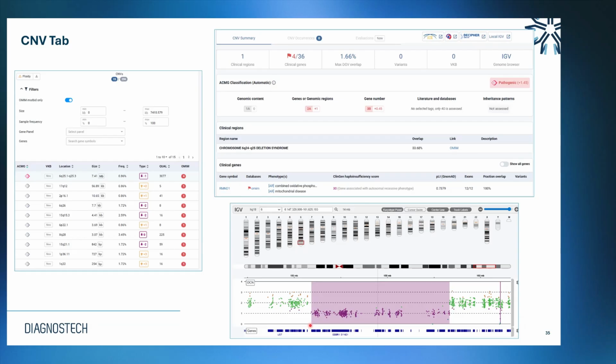It is, as I said, quite a large region of about 7 megabases. And what we are looking at here is the diploid copy number. So obviously being humans, we have 2 chromosomes, so we should have 2 copies of each gene. And that's indicated by these green dots. And these are the probes that were actually used, and we can see the genes at the bottom. So this is normal, being 2 copies. And then we see this drop off here for this section, where we only are seeing 1 copy of the gene throughout all these different genes, right until here where it goes back. So this would be quite a big 1 copy loss of this large portion of the genome.